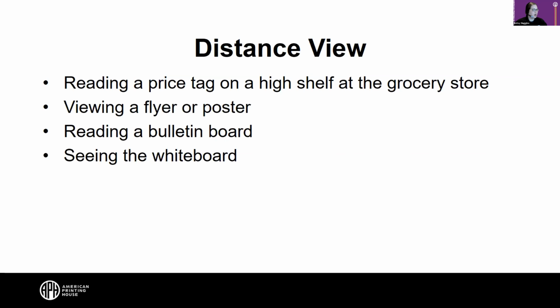Someone asked in the chat how easy it is to switch between the different modes. Can you just talk about that briefly? Oh yeah, it's pretty easy. It's just a camera that spins. It just rotates. So you can just take the camera and rotate it into the view that you want it to be in.